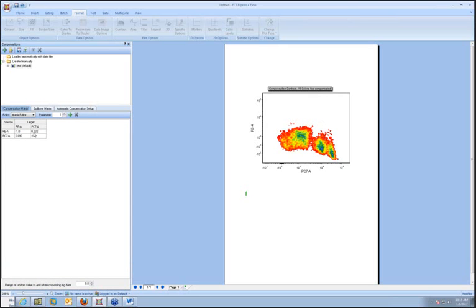You can see the spillover matrix. Normally, the diagonals of the spillover matrix are 1. The reason they're not 1 when you do the manual compensation like we did is that we're adjusting the sliders. We're actually adjusting the compensation matrix directly, not adjusting the spillover matrix. Okay, and if you don't know the difference between that, it's not important for now. Feel free to write us an email or something and we can explain the difference.